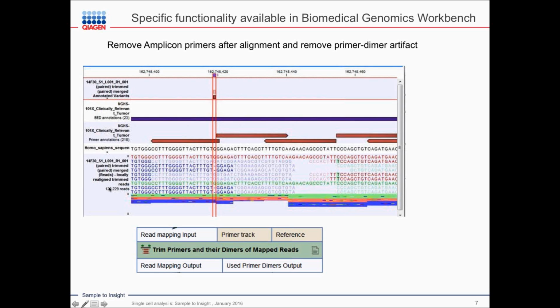And when you're looking at the reads below, you can now see those reads that are in the reverse orientation, those reads that are in the forward orientation, and you can also see paired end reads. So here we're seeing one side of a paired end read, and you can see that part of the paired end read, which includes this shaded area, and this shaded area maps to these primer regions.